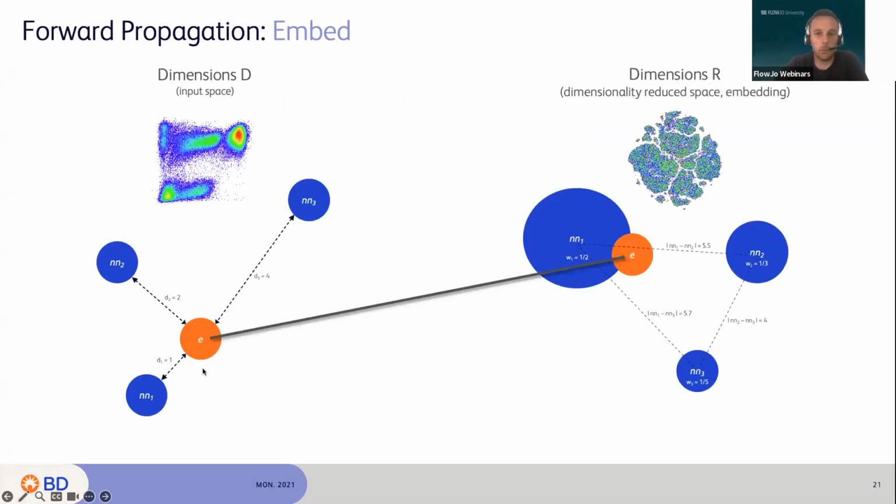So basically your parameters, CD4, CD8, whatever markers you put. We're going to use the nearest neighbor, and try to figure out the closest nearest neighbor to every given cell based on the measurements physically done. So here are the cells where we found the cluster, and we're just going to give you a score based on the distance between the other cells.